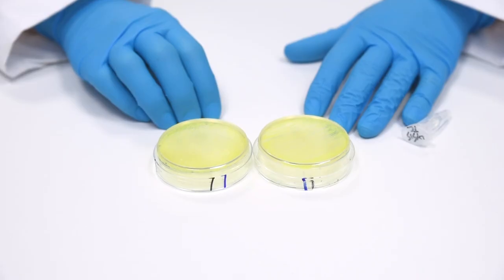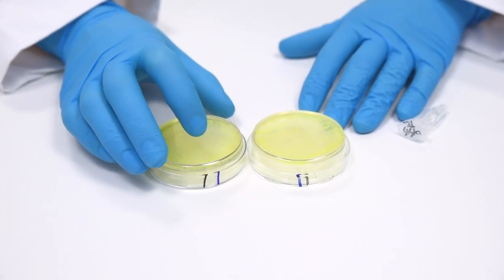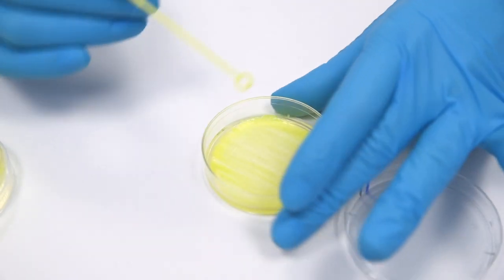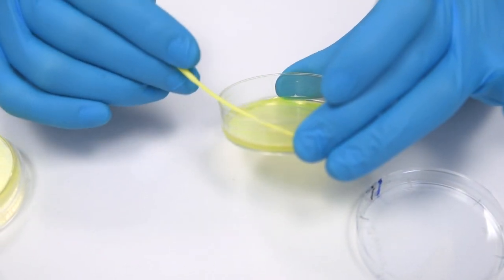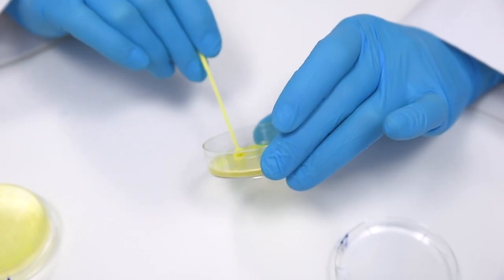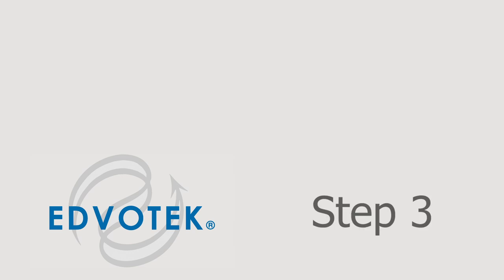Step 2: Select a GFP plate showing the highest GFP expression after overnight incubation at 37 degrees Celsius. Using a sterile loop, carefully scrape the entire cell growth off of the GFP plate.